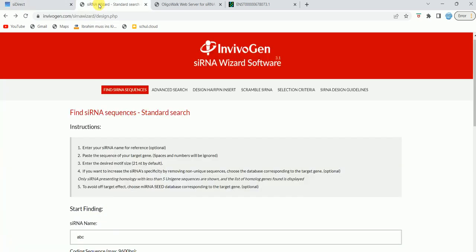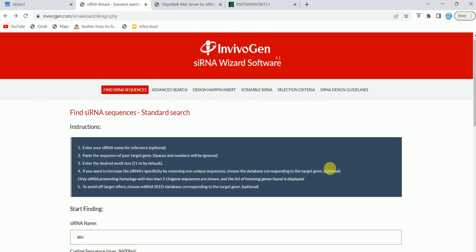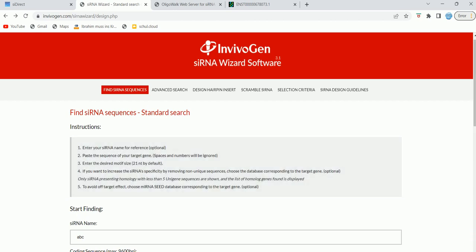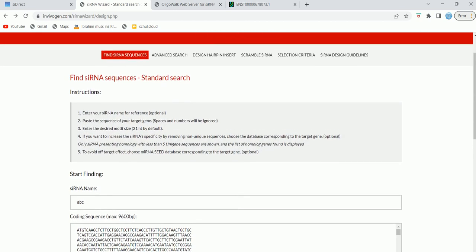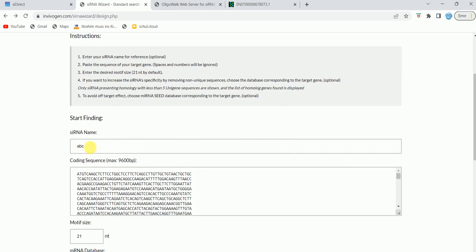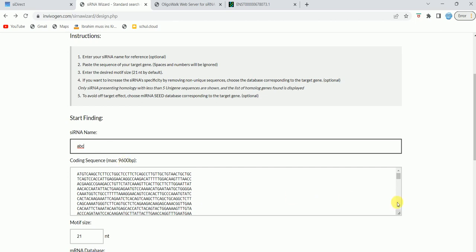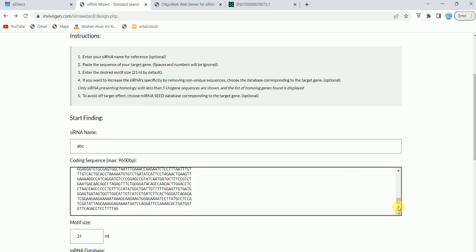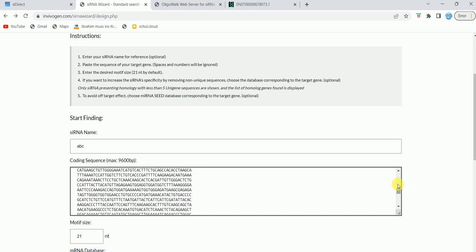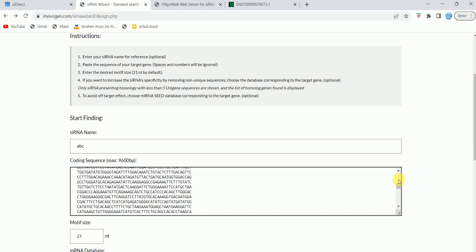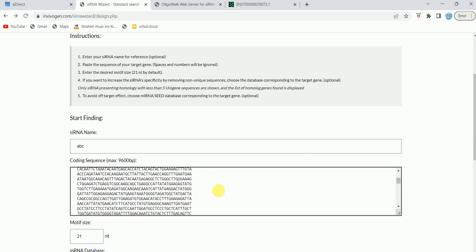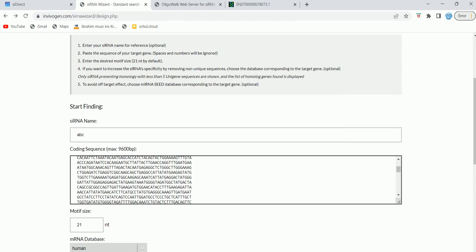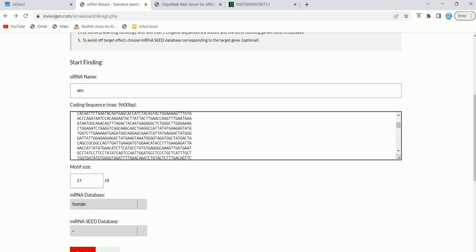Another tool is called siRNA Wizard. The website is invivogen.com/sirnaWizard. Here, what you need to do is put the name of the siRNA. For the purpose of demonstration, I have put ABC in this start name area, and the coding sequence—the maximum you are allowed to put is 9600 base pairs. Here I have already put the coding sequence, so it is below 9600. Basically you can design siRNA against any of your coding sequence of interest.